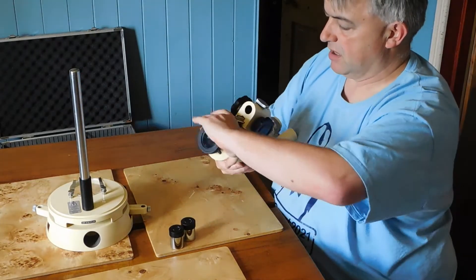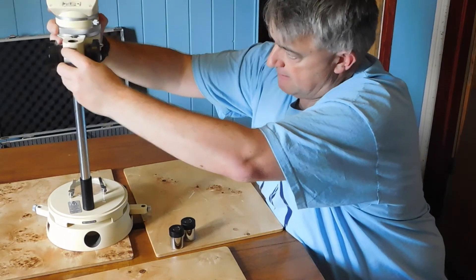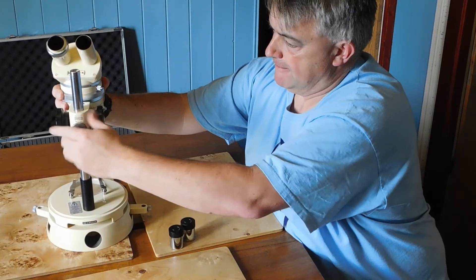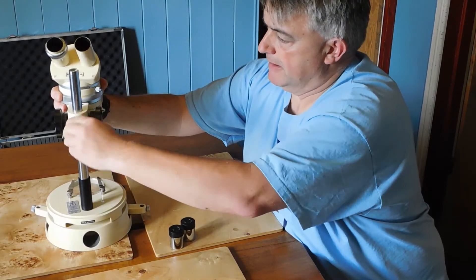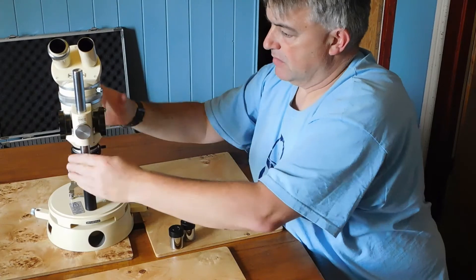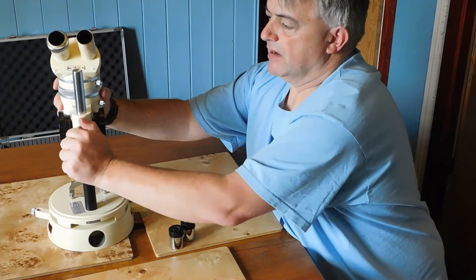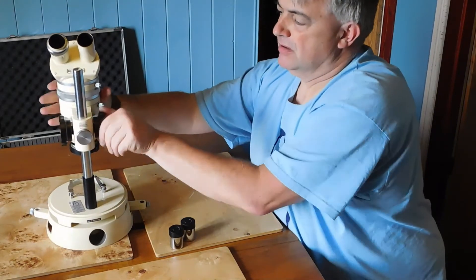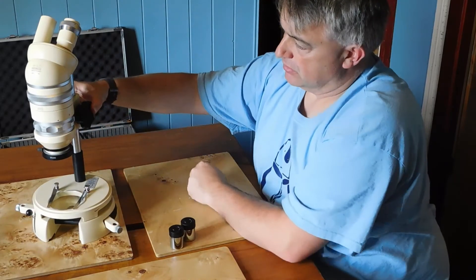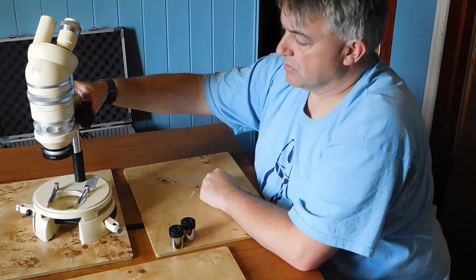We now take the main scope and you can undo this here and that will slide down. We'll do that up, and if we get that nice and tight, the scope will actually sit nicely there on the top of the base and we're ready to use the microscope.